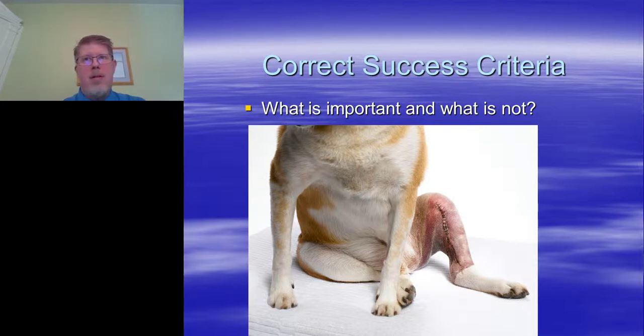So I spent about 7 hours in the evening until about 2 o'clock in the morning, re-anesthetizing and re-closing every animal and doing it properly. Because I went in there with the wrong goal. I was trying to make it pretty, but I needed to make it strong. So if you have surgeons and you want them to get to that point, here's what they need to do.